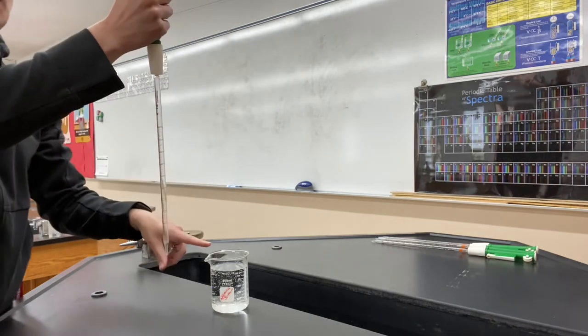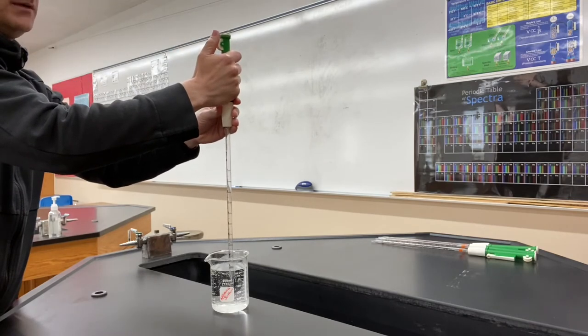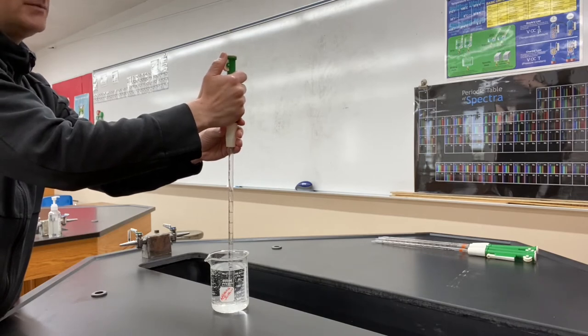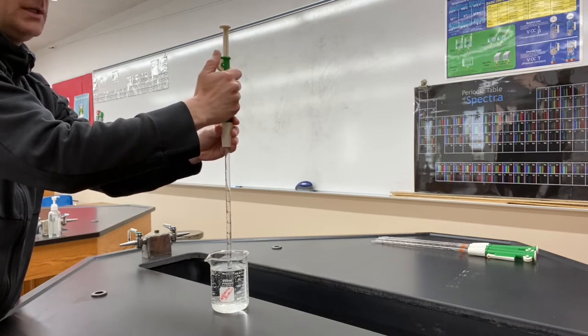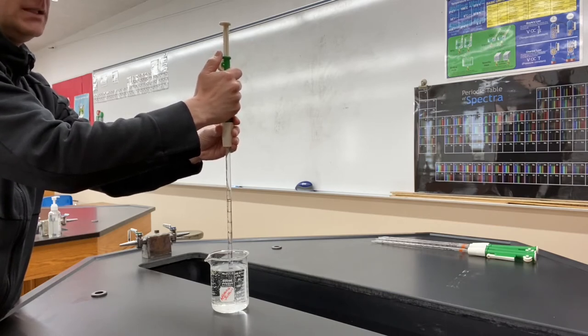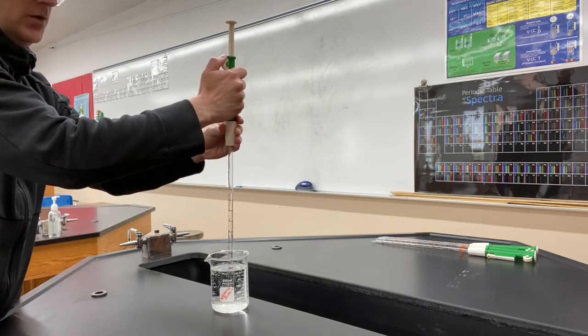I just have a beaker of water here to practice. I put the tip of the pipette in the water. You can also kind of gently rest it on the bottom to make sure that you stay in the solution. And I'm just wheeling up the plunger. And hopefully you can see the water rising in the tube. There's a little bit of a time delay sometimes, especially if you're holding the pipette tightly against the glass. And then I'm gonna just try to fill it all the way up to the 0 mark at the top.